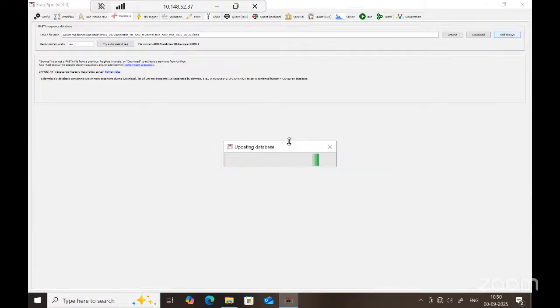Decoy is basically a completely reversed version of the entire FASTA file of the rat proteome. You have to find any kind of false hits to control the FDR. So this is basically a non-existent database that will try to match with your original database and remove the false positive sequences of the proteins. It's taking some time to upload the database.